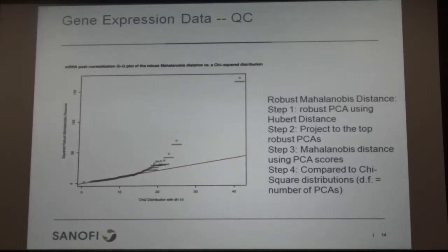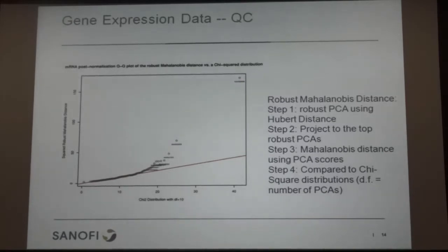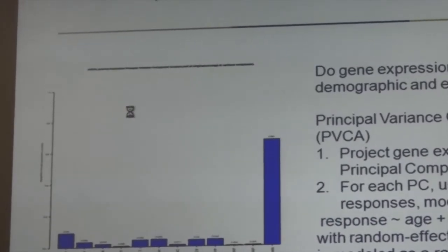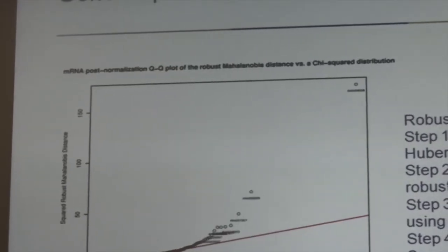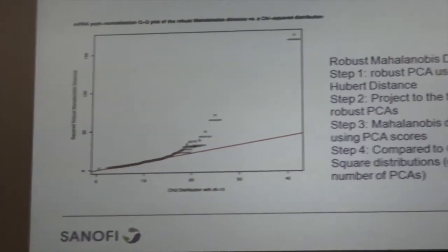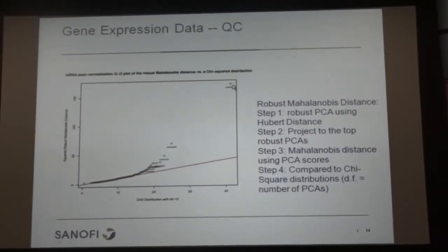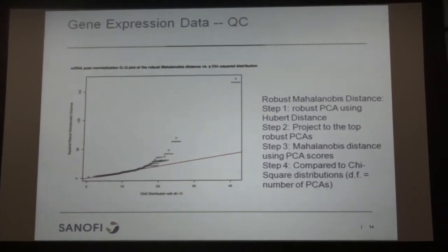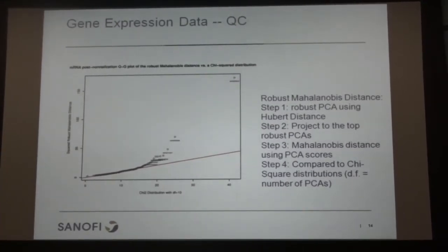We make a QQ plot: the x-axis is the theoretical chi-square distribution with degree of freedom 10 — the number of principal components kept — and the y-axis is the quantile from the observed data. A big deviation suggests those data points may be outliers. The top point shows a really large deviation from the theoretical chi-square distribution, and this turns out to be the same subject we identified in the previous QC analysis.